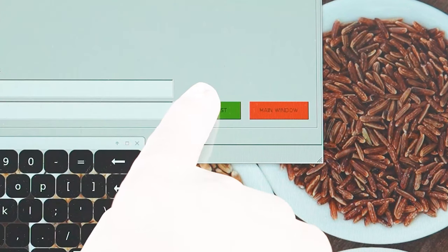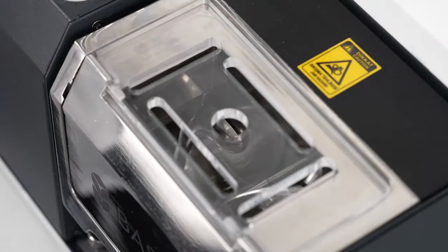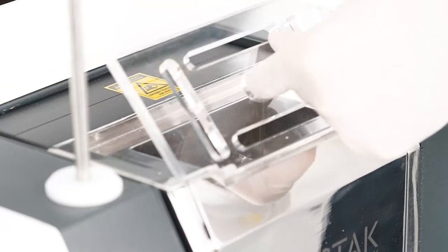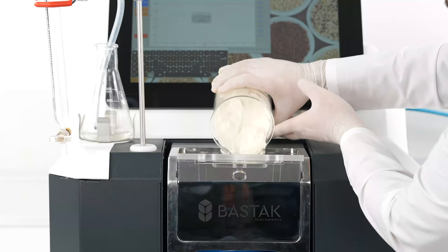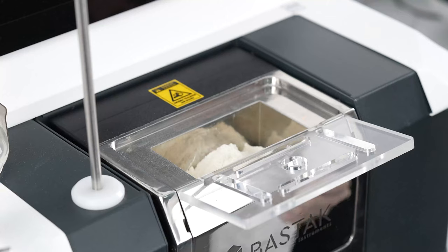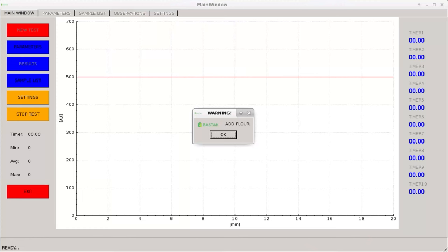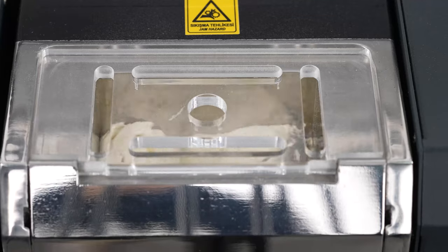The start test indicator is selected and the engine of the device starts to run. After 10 seconds, an add flour warning is displayed on the touch screen. The cover of the kneading unit is carefully opened and the flour sample is poured into the sample container of the kneading unit. The plexiglass cover is carefully closed and the OK button is pressed. The kneading blades then mix the sample for 45 seconds for homogenization.